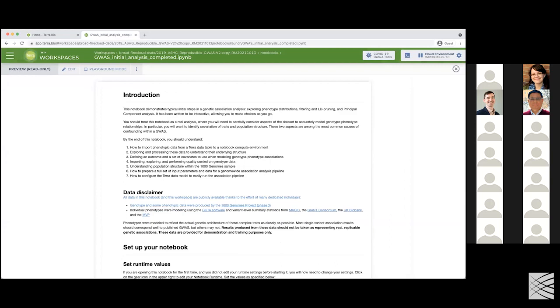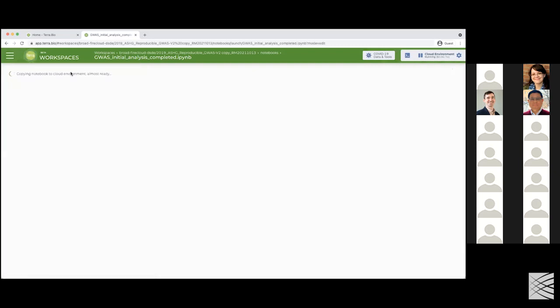Okay, so how I know my cloud environment is running now is that circular arrow icon has changed to a pause button. And that means the current status is running. And if I wanted to stop it, wanted to pause it, I would click that pause button. Tells me it's running at 6 cents an hour. And now I can click the edit button.